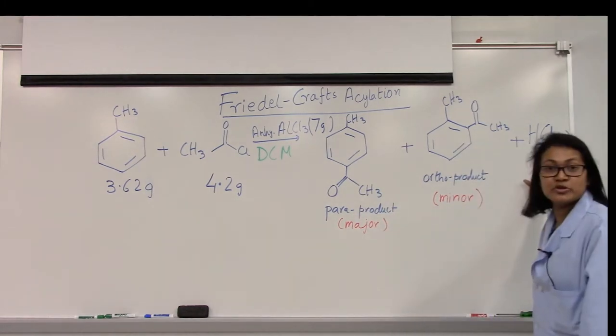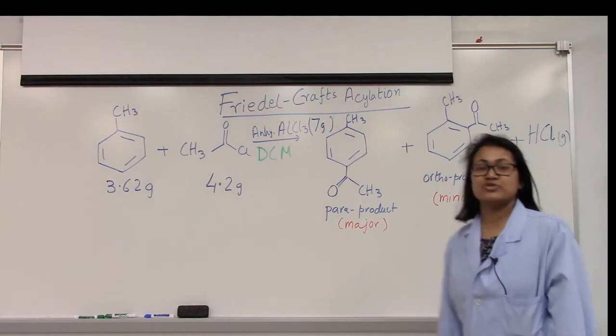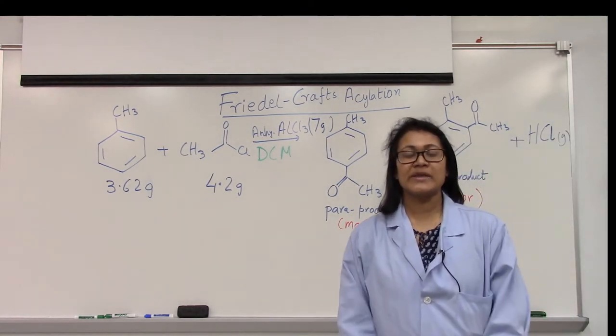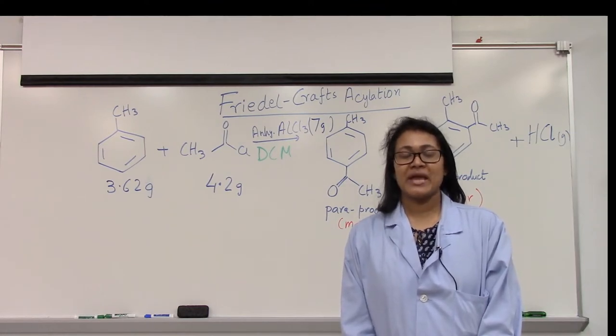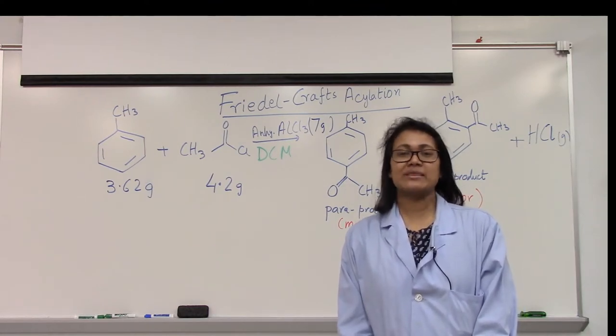And we also produce HCl gas, which is trapped with a glass funnel inverted on some water. So let's get started with the reaction, and at the end of the reaction, we'll get the mass of the product.